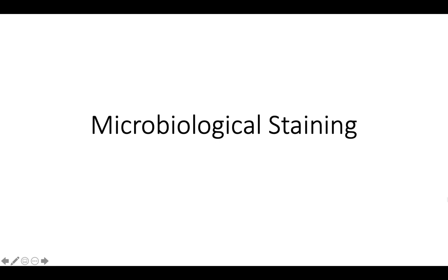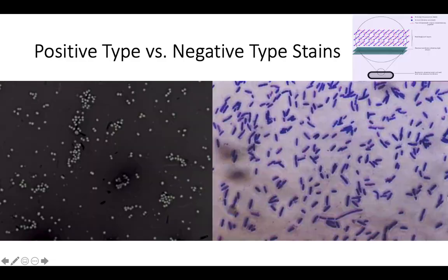Okay, guys, so this lab's going to be looking at some of the common microbiological stains, some of the different types of techniques and stains that will be used in a lab, how those stains work, and some of the main different categories of stains that you'll find in a microbiology lab.